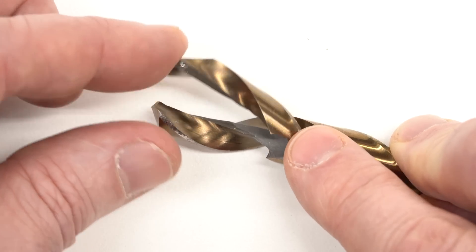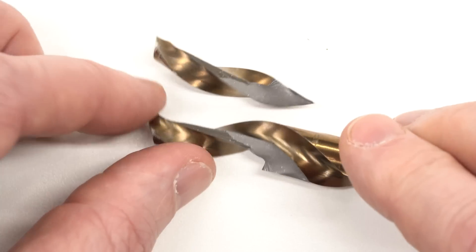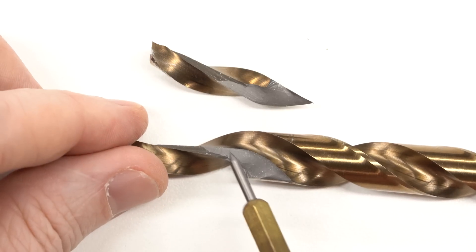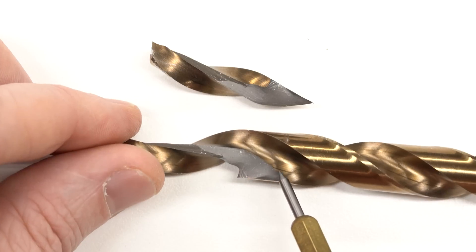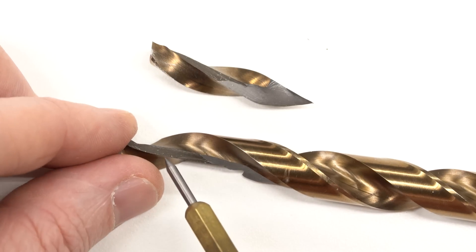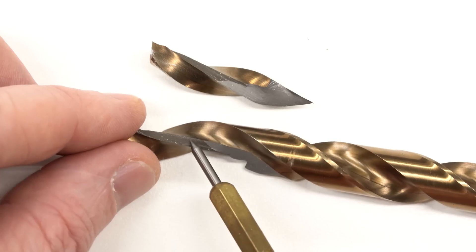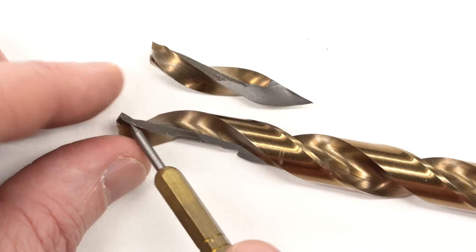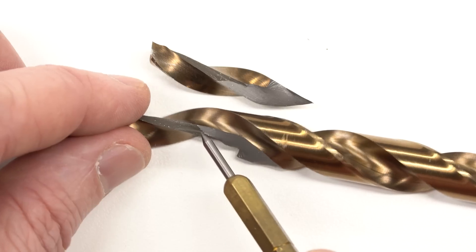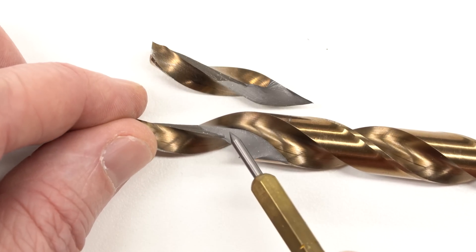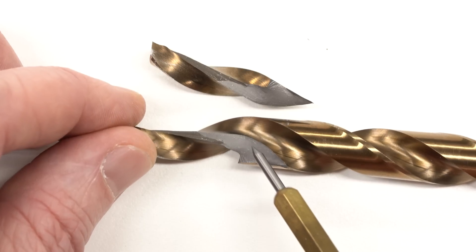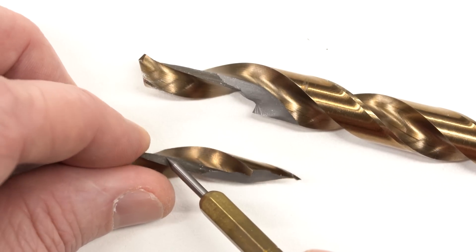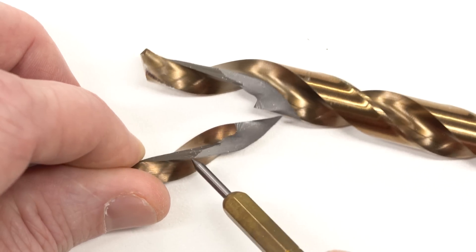In any case, the drill's covered under warranty so I'm not worried about that, but the way it failed kind of piqued my interest. Not only does it seem unusual to me that it cleaved off a single piece, but also if you look at the fracture surface there are two different colors here. The color out here at the tip is dark and kind of brownish, and then back up at the root of the fracture you can see that it's sort of this silver gray color. The texture is different as well. Now the color here at the end, I can't help but notice, looks very similar to the color on the outside of the drill. These are not coated drills, this is just bare metal but it's been oxidized as a part of the heat treating process. And so I'm starting to think that maybe this drill was already cracked and the inside of the crack was exposed to oxygen during the heat treating process, so it has that same gold colored oxidation that's on the outside of the drill.